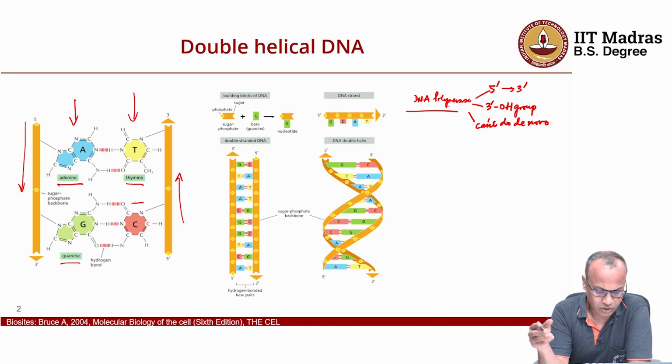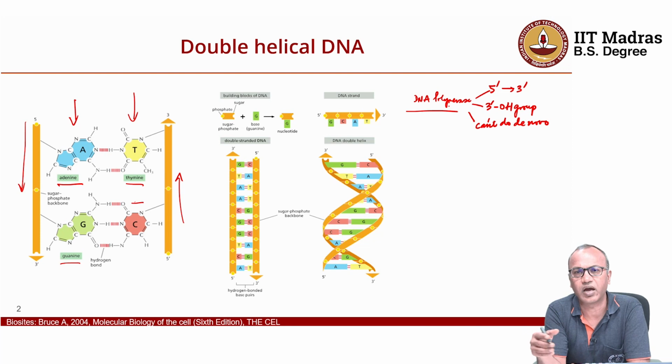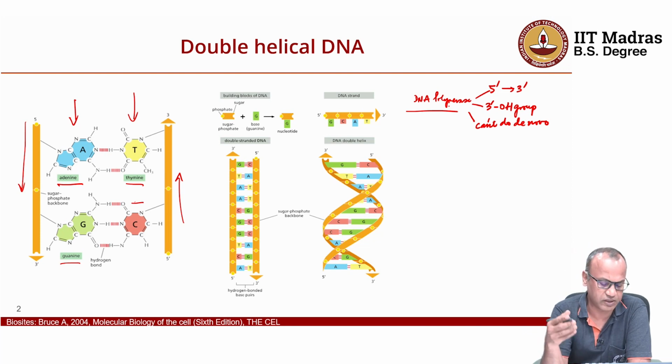So without spending too much time again on how DNA is replicated, what we will see is how we generate, how we read DNA. From an unknown organism, if I extract DNA, how do we read it? That was the biggest challenge. And now the technologies exist that we can read DNA very rapidly, but the basic principle remains the same, as we'll discuss in the next few slides.